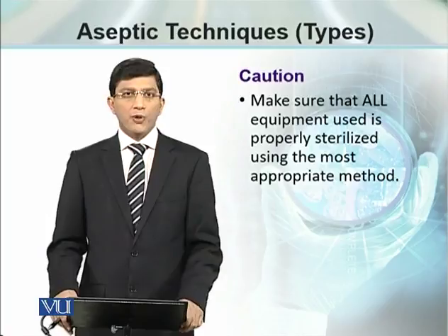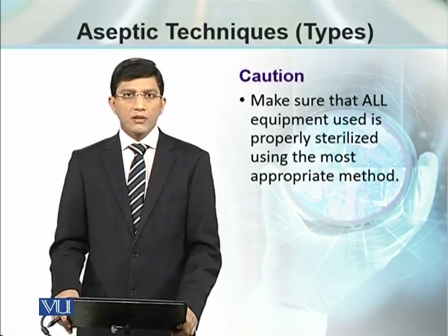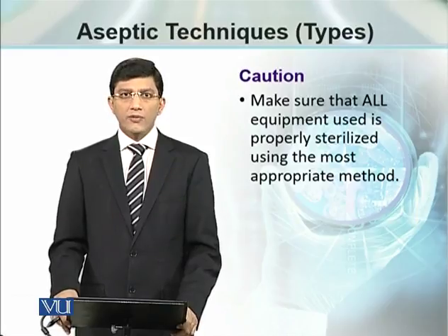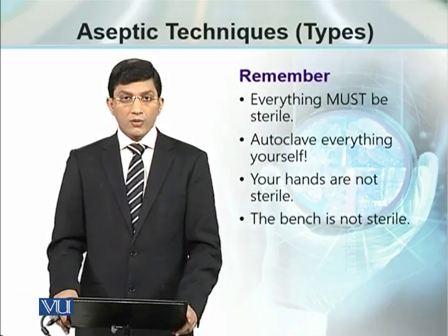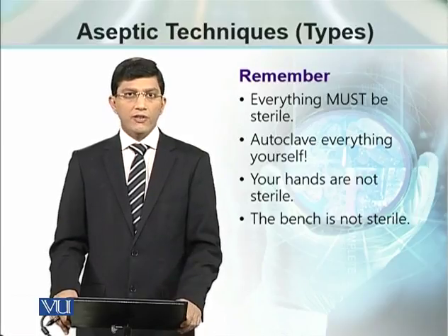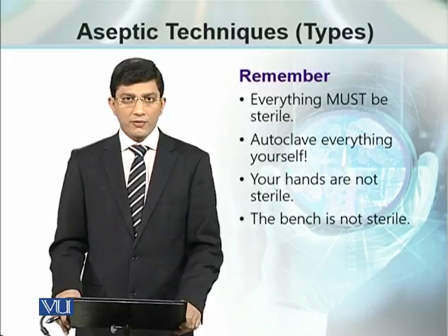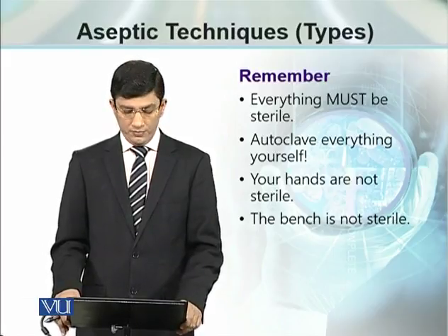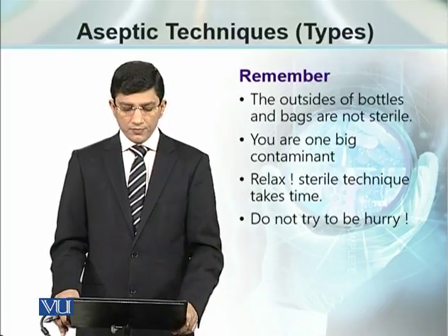Make sure to use the appropriate method to sterilize the appropriate equipment. You cannot autoclave a working bench. So, while working in the lab, everything should be sterilized. Autoclave everything by yourself. Don't trust others. Make sure the bench is sterilized.